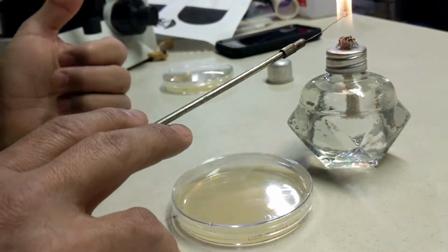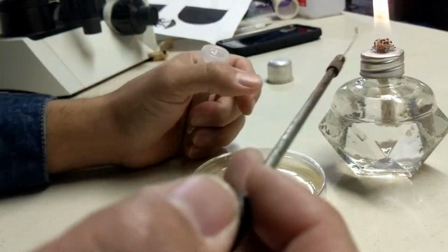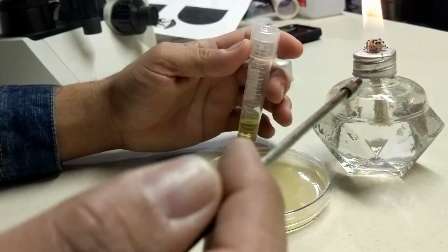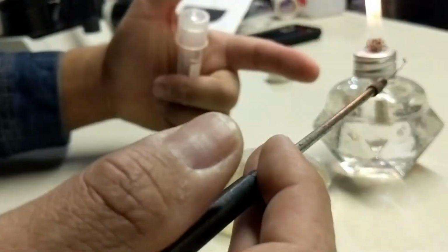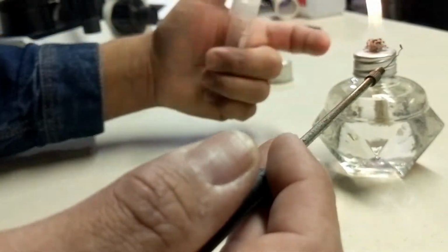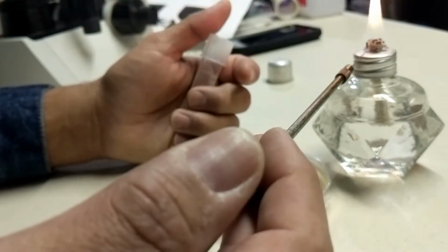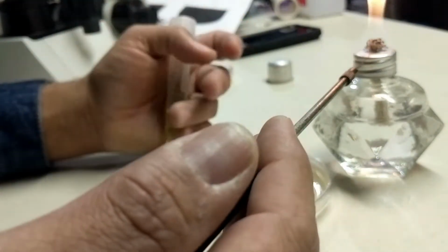All right, so after it's pretty much sterile, then you try to get that loop a little bit cold, because right now it's literally red hot. But you leave it closer to the fire. Why? Because this is very hot in here, so there's nothing really, no bacteria, spores that get here. Now if there's some spore hanging around, it would get burned in there. And bacteria, unless they are on saliva or drops of water, they don't have wings to fly away.